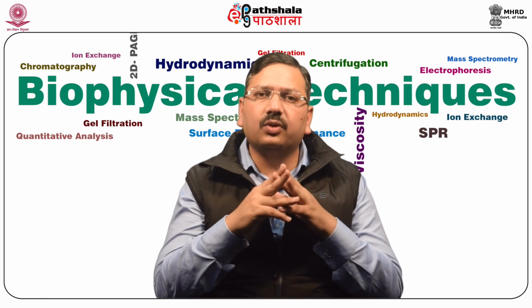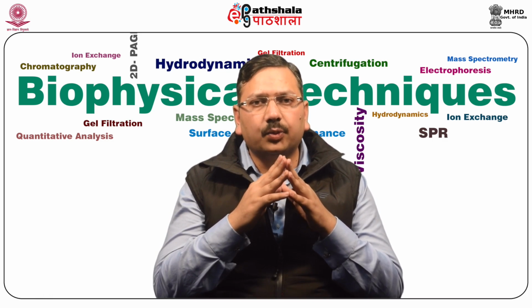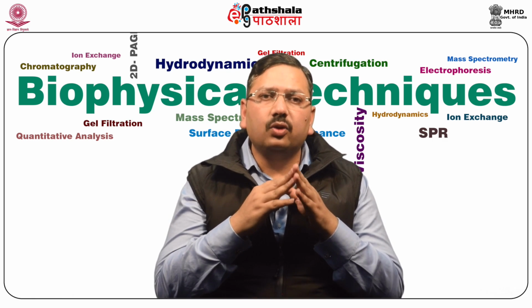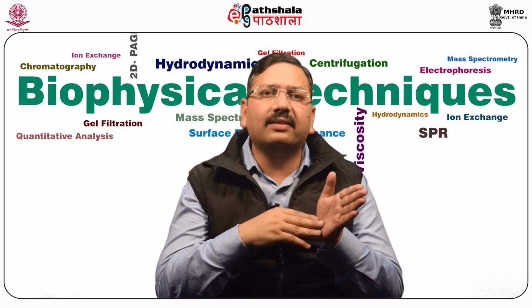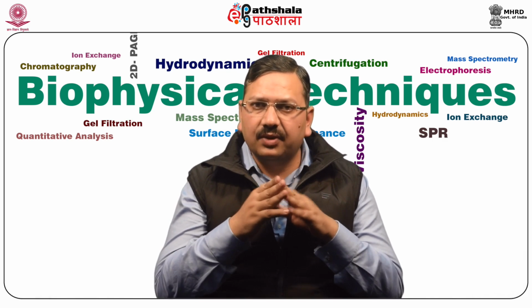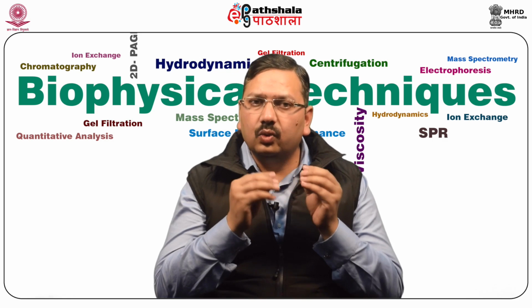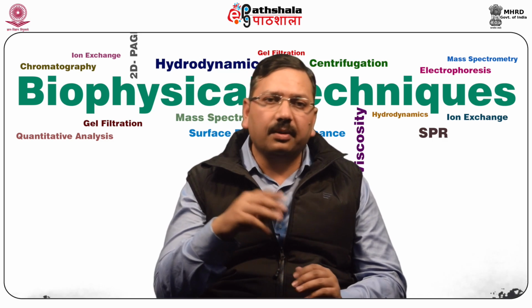In biological systems, you will find that matrix assisted laser desorption ionization, or electrospray ionization, are routinely utilized, and these are the methods of choice for biological sample identification. Both positively charged and negatively charged sample ions are generated according to the proton affinity of the sample. The ionization method to be used depends on the nature of the sample and the type of mass spectrometry.